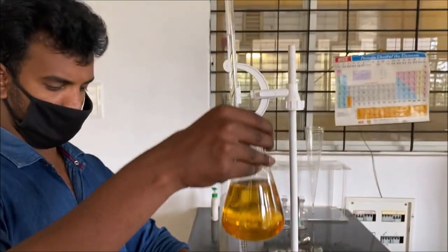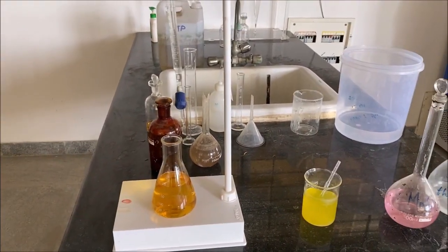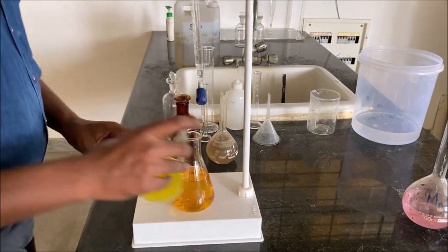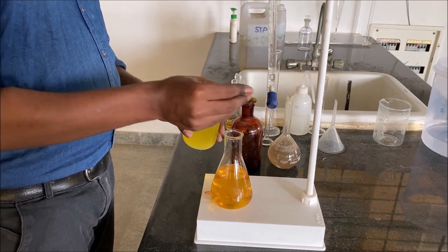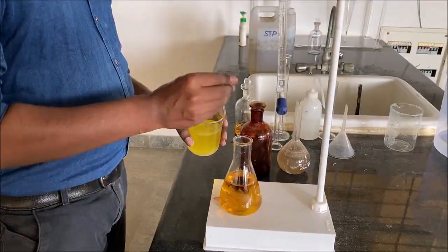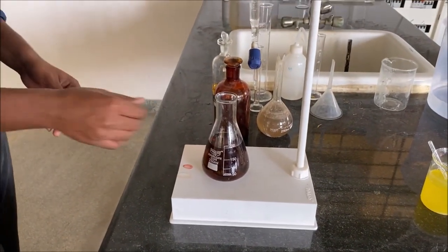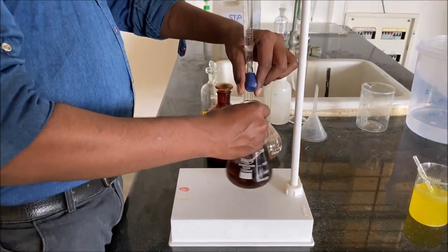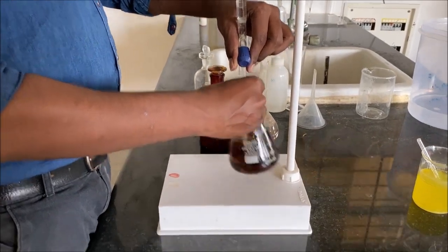So now the solution has turned pale yellow. At this point of time, we have to add 2 ml of starch solution. You can see a change in the color. After adding the starch solution, the solution has turned blue, and it is titrated against sodium thiosulfate solution until the blue color completely disappears.